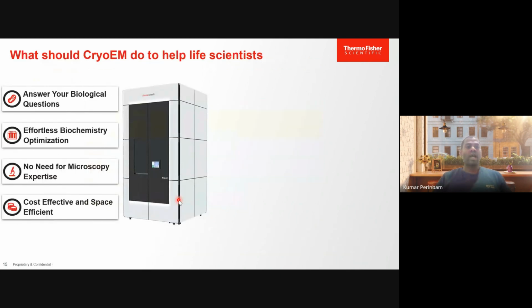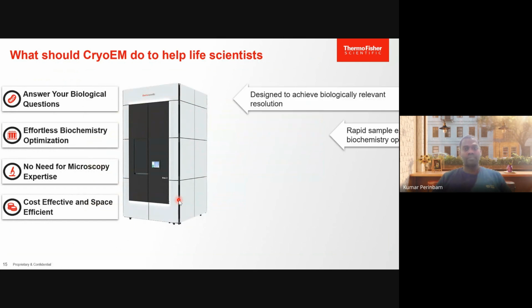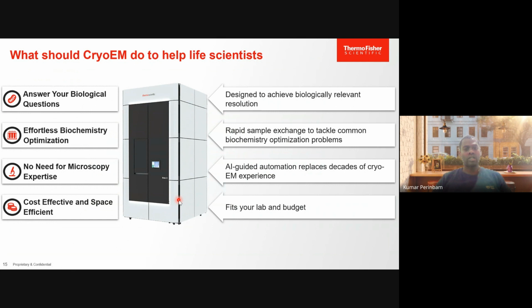So what we have is a Cryo-EM tool at 300 kV, and this is the best EM tool in the world. So this is used for biological studies.